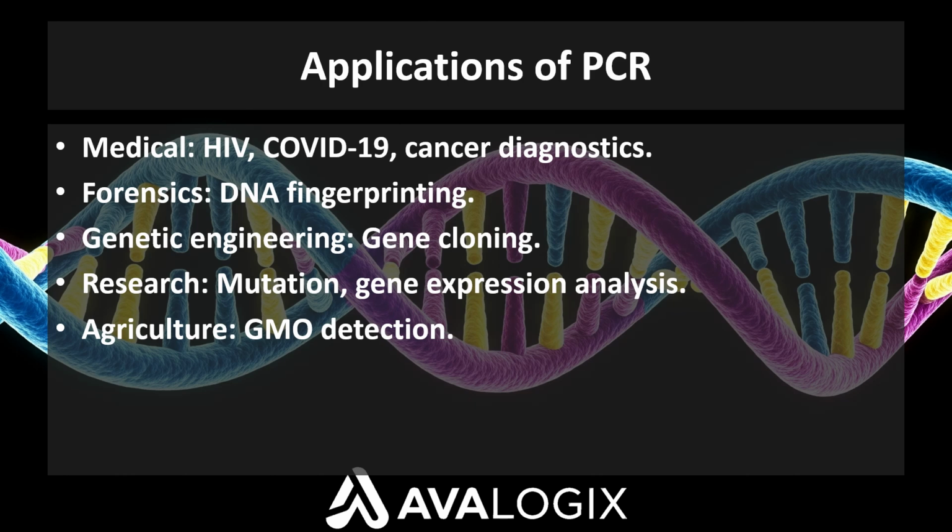As you can see, PCR's versatility makes it one of the most important techniques in biology today. In the next slide, we'll explore the limitations and challenges associated with this powerful tool.